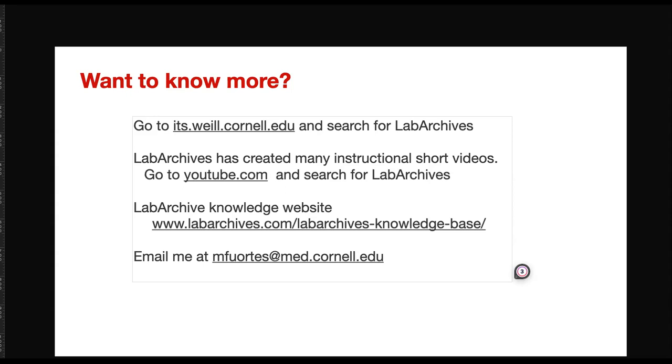Excel is incredibly powerful, but we find it to be best for data analysis rather than data storage. With the data collected for your project in either RedCap or LabArchives, it provides a great segue to being able to upload your data somewhere else.